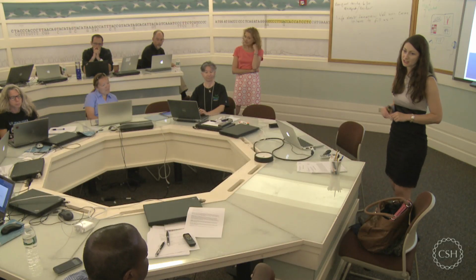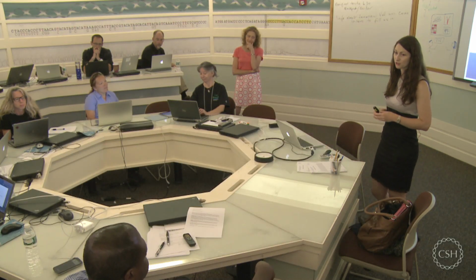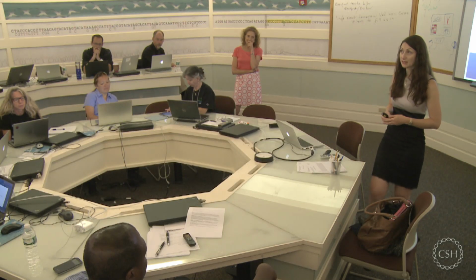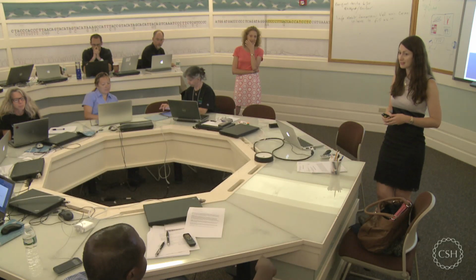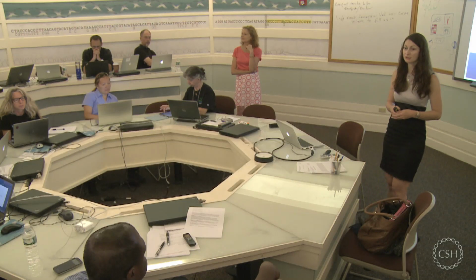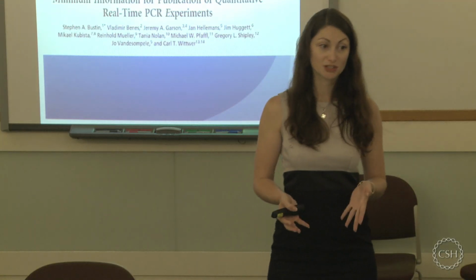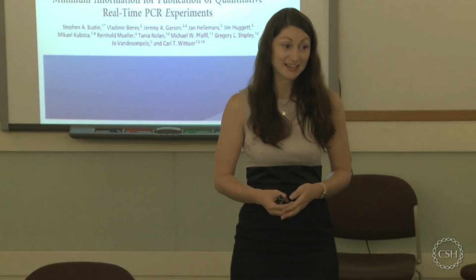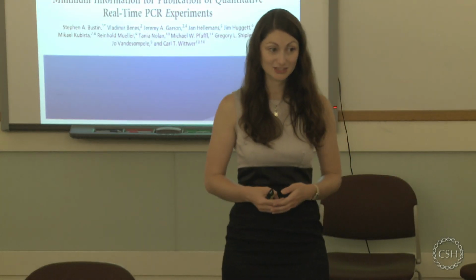There are no such guidelines as there are for standard long genes. As far as I know, microRNA people usually use northern blotting to verify that data. In some cases, you can also use qRT-PCR, but if I was working with small RNAs, I would definitely go for northern blot, although it's elaborate and not fun. But I think it has its justification there.